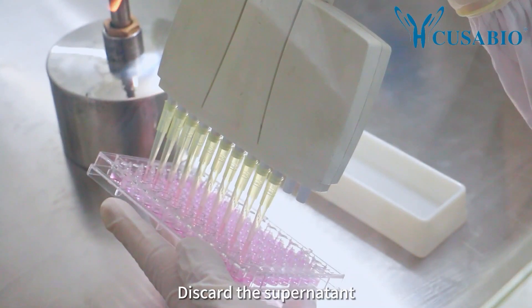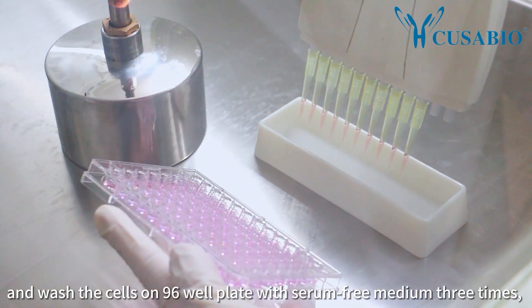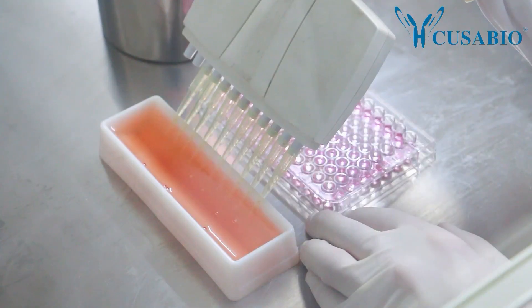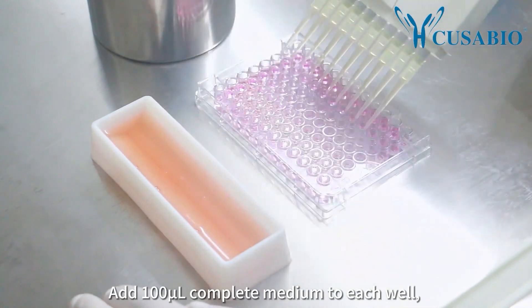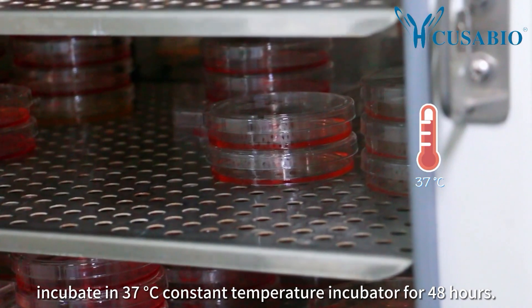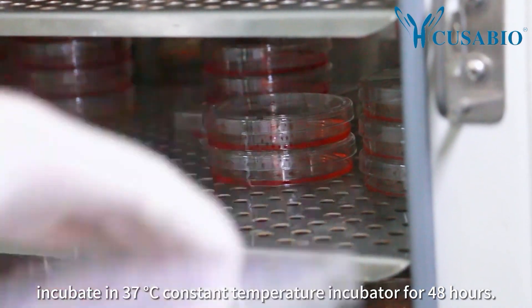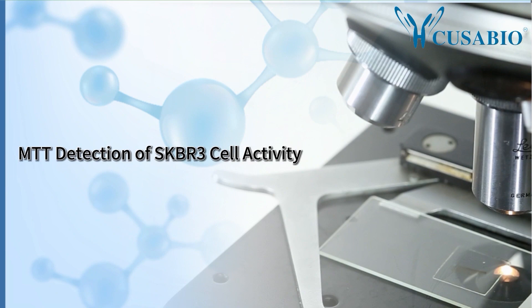Discard the supernatant and wash the cells on the 96-well plate with serum-free medium three times, each time for one minute. Add 100 microliters of complete medium to each well and incubate in a 37°C constant temperature incubator for 48 hours.